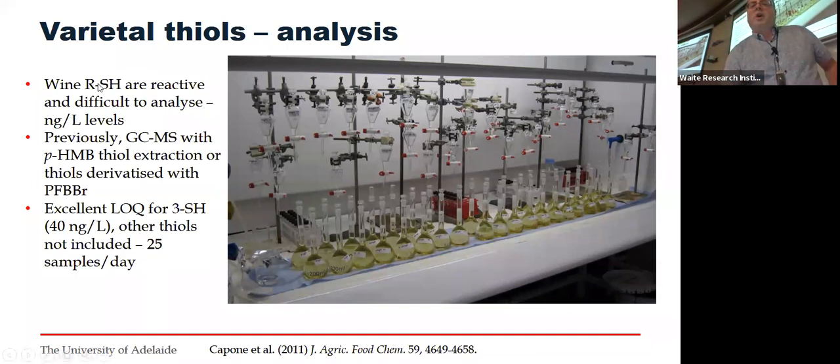It involved derivatization of the thiol, so it's no longer reactive and it performs better in the instrument. We can detect it and analyze it much better if it's derivatized. It's no longer so reactive, but the sensitivity is enhanced as well.